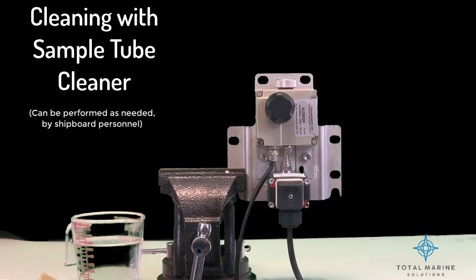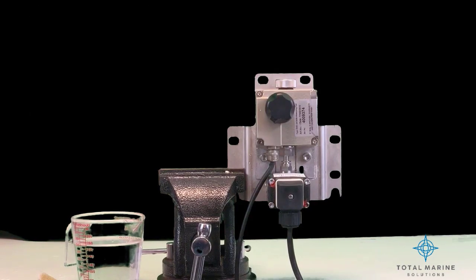Cleaning with sample tube cleaner. For intensive cleaning, use the sample tube cleaner from the service kit.